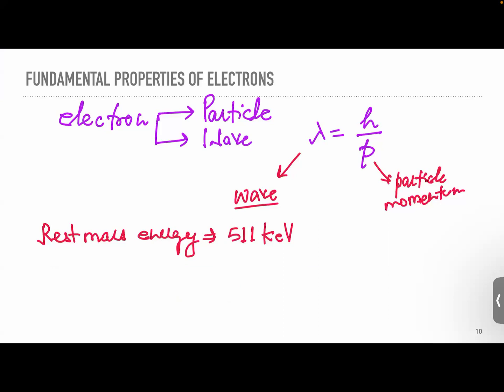So that's why, when we are talking about the analysis, if you see the direct picture, you will not be able to analyze it that much. You can see a picture which has a very contrasty area, very dark area, but you cannot tell directly which area is zinc, which area is cobalt, and which area is what. But because you already have a database, a catalog, which knows the contrast ratio for each element, you will use the software and you will get to know the element proportion in your sample. Okay, got it.